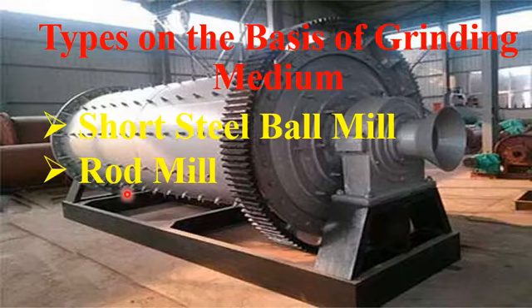To ensure the final effect of the grinding, the staff will place the cylindrical steel rod in the first bin and the steel ball or steel segment in the several other bins. Okay. In simple words, the rod mill process usually uses steel rods and their diameter is around 50 to 100 millimeters. But the issue with the rod mill based ball mill apparatus is that they require longer time to grind the bulk or precursor or initial material.